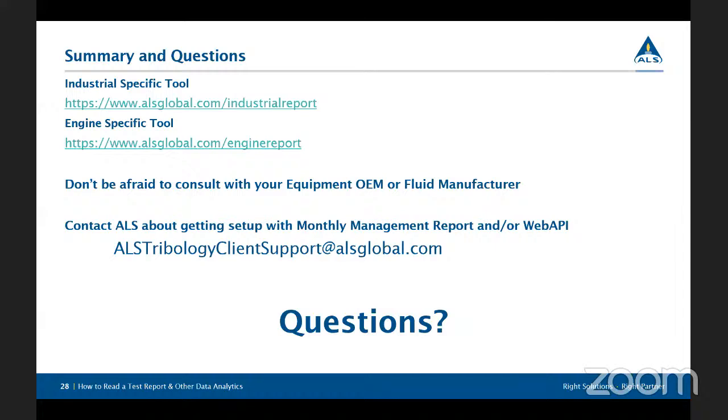Now, you might want to reach out to me about this, Vishnu, but it would be interesting. So we do coulometric water by Karl Fischer testing at the laboratory. I might need some more clarification on whether it is the laboratory that's showing higher moisture in a gear, and why. If that is the case, then what you'd want to look into is what I was describing before: is condensation occurring?